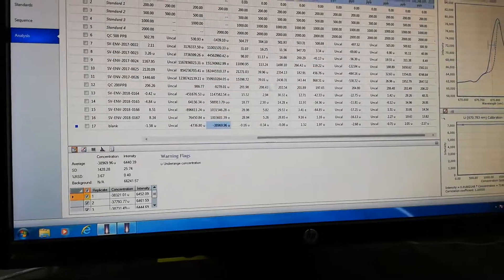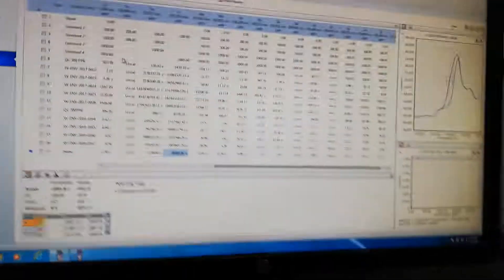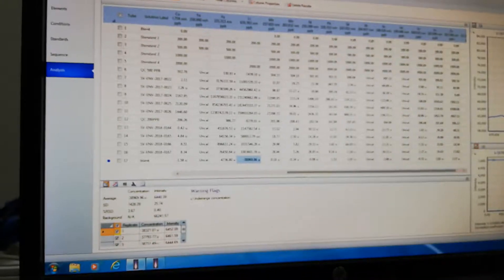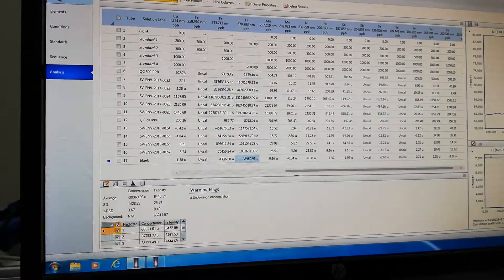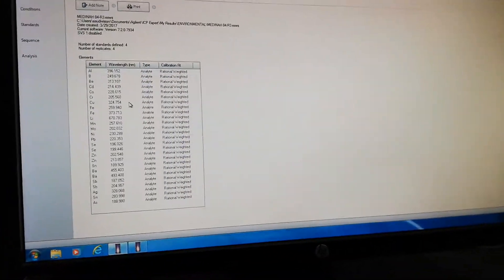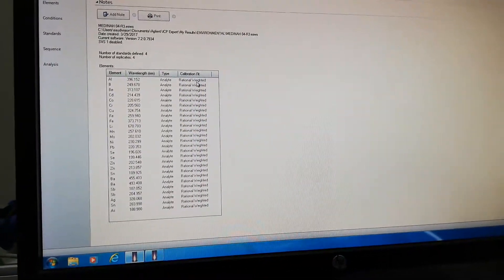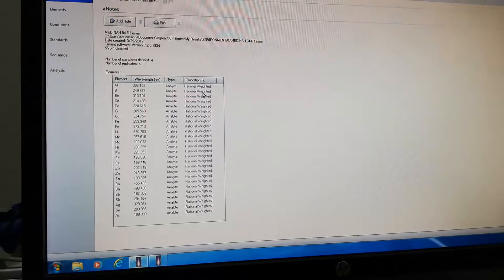Here is the analysis. When you open this file and worksheets, there are different types. Summary shows the metals you want to analyze. This is the calibration fit.